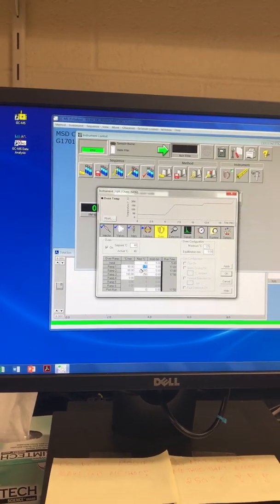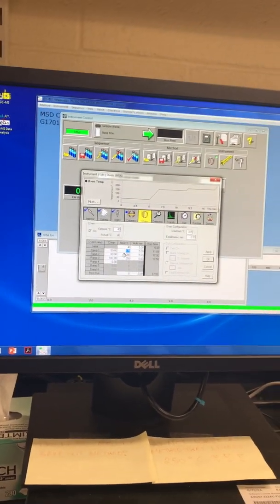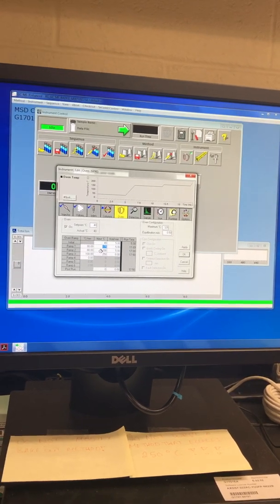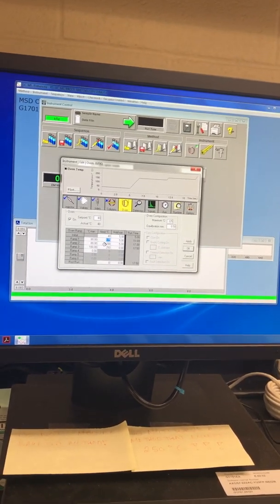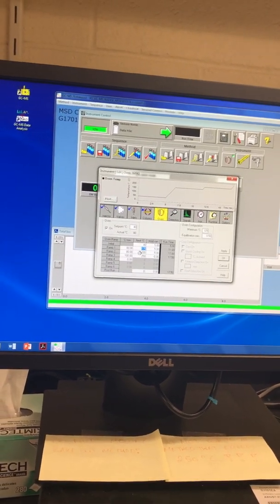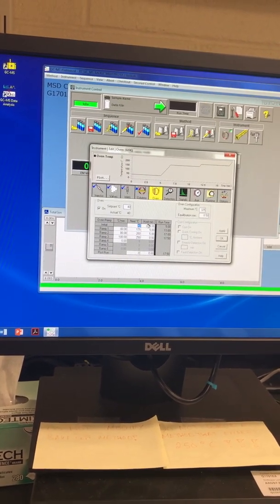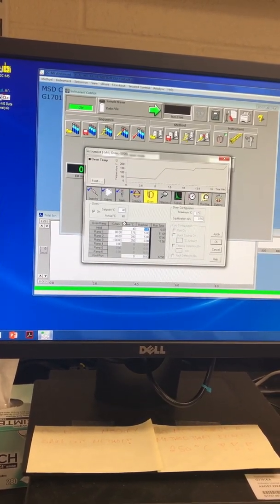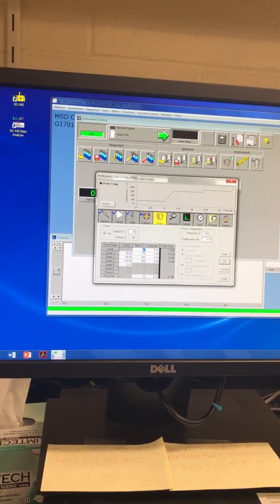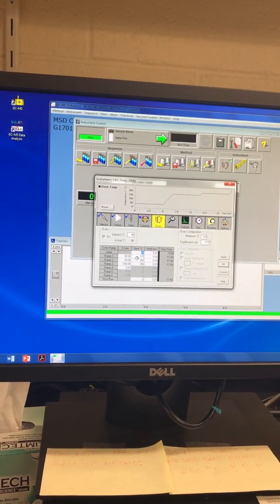So what I noticed for O-xylene was that even though its boiling point was 144 degrees Celsius, and I expected it to come off at about 160 degrees Celsius or 150 degrees Celsius, it actually came off at around 40 degrees Celsius. So what I did was just leave the 40 degrees Celsius for a 5-minute hold, which was expected to include not only the solvent but also the O-xylene that should be coming off. So that should be fine.